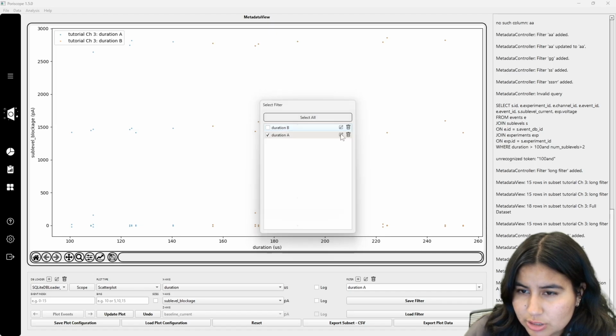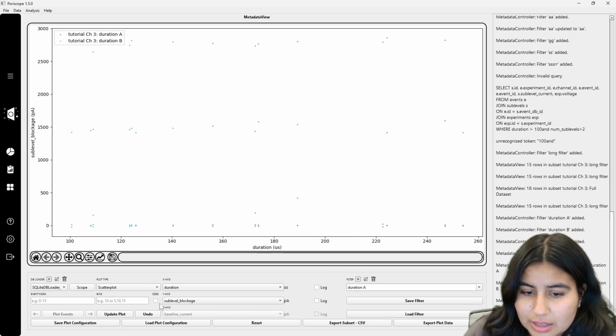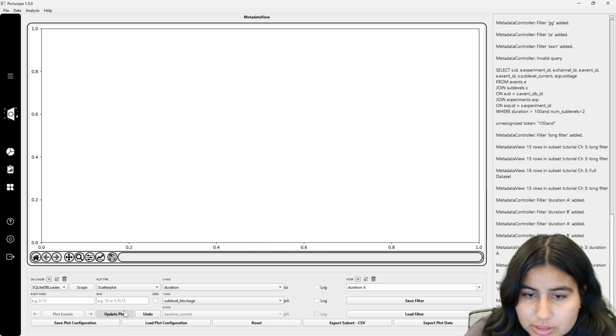So that's duration A. Yep, perfect. And then let's update our plot. Let's reset this, update our plot.